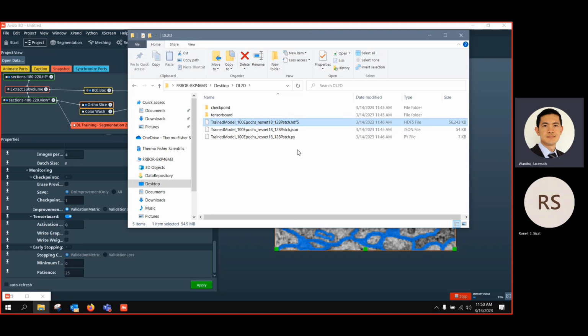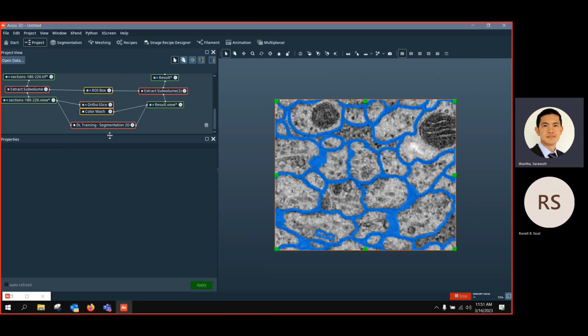That also comes to the next point, what I was saying before. In terms of training, we already provide segmentation training. But for prediction, if you obtain the architecture file model yourself, you can try to use it in the prediction. And we also provide the membrane denoiser file, so you can directly use it. But we don't have the module to train the denoiser. Okay. Any questions so far on this step?